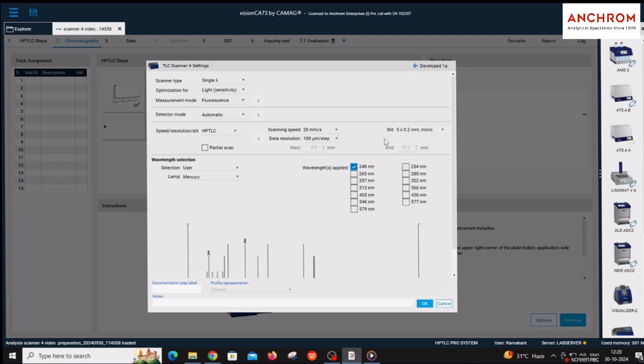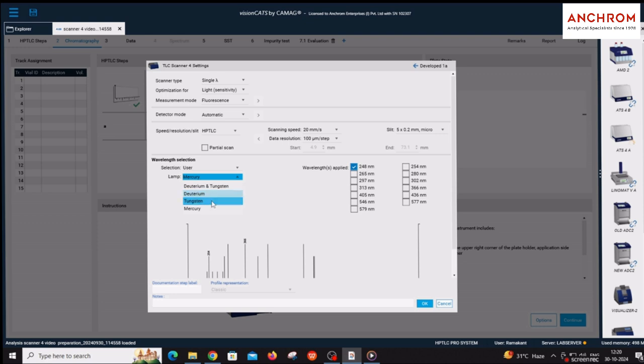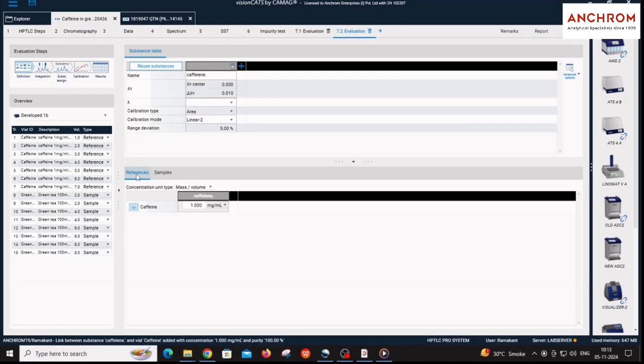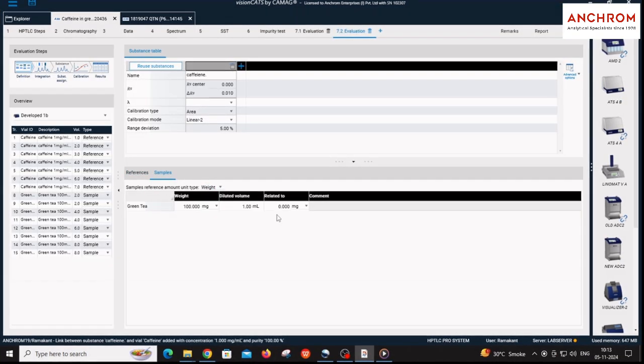Start and end scanning should be kept by default. Under wavelength selection, first select the lamps as per requirement such as deuterium, tungsten, or mercury lamps, then select the specific wavelengths according to the lamps selected. Fill the concentration of standard and sample solutions.